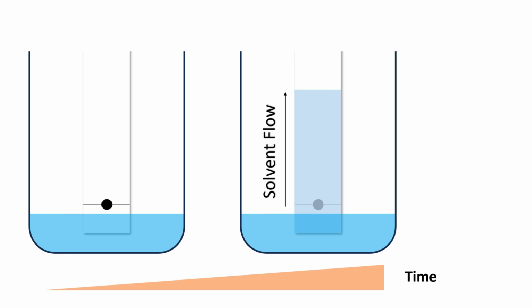For this purpose, we have taken a beaker and a solvent. The solvent could be water or alcohol. Place the filter paper upright in this solvent and let the beaker rest. After some time, we will observe that the solvent in which the filter paper was placed upright has started to flow, and after reaching a certain height, the solvent got stuck in the cellulose fibers of the paper.